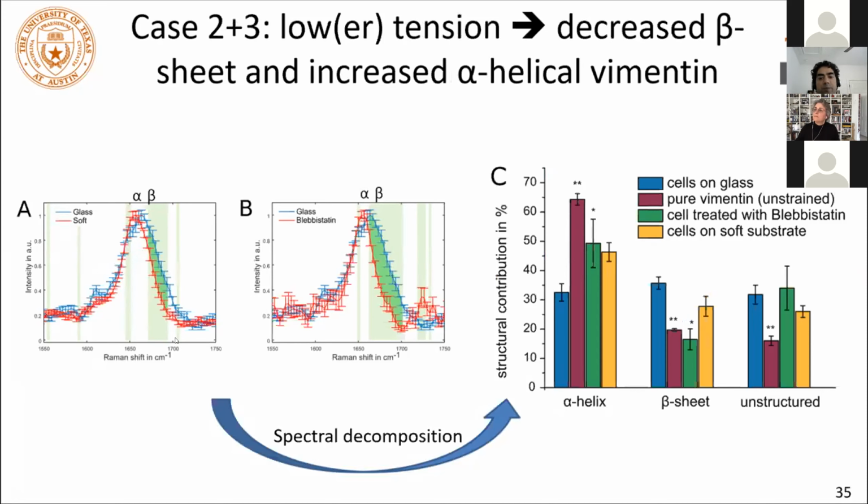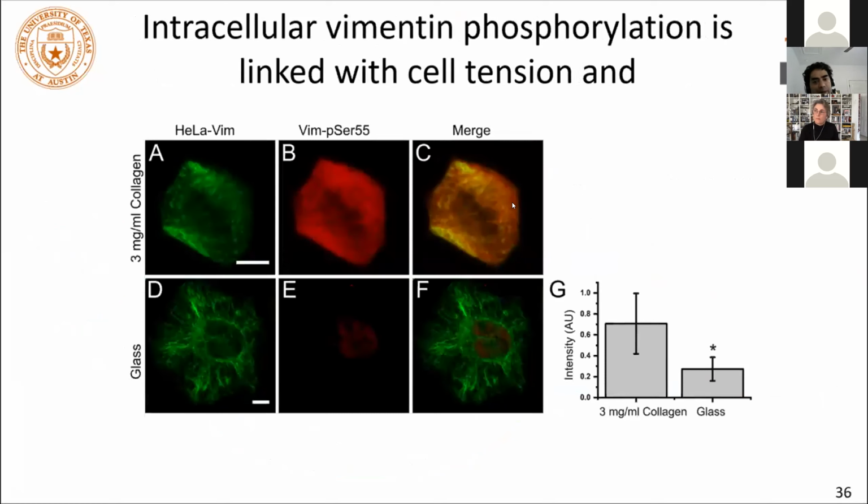And that's the first time that people have been able to see that, but it's been hypothesized for a while because they couldn't determine the protein structure within cells, right? And so here it's just a quantification using spectral decomposition of how the structure changed within cells, okay, from these different spectral fingerprints that we isolated. And so the implication of that is, again, biochemistry, right?